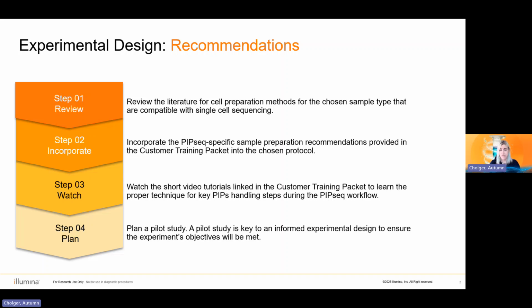We want to make sure we're reviewing the literature for those methods, what they're compatible with single cell sequencing. And then we want to make sure that we're incorporating the PIP-seq specific sample prep recommendations from the customer training packet. For those that haven't worked with Illumina Single Cell before, the video tutorials on the website are a fantastic way to see proper PIP handling technique for the PIP-seq workflow. And it's a great review for those that are used to the workflow or have done it before as well.